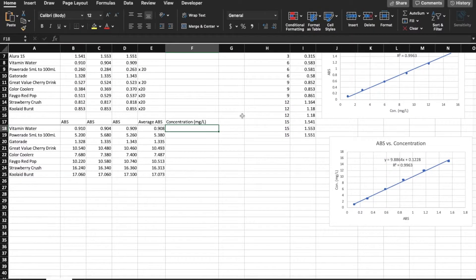So I'm going to use this equation that I got from the graph to find the concentrations of all the commercial products. So if I plug that in Excel's formula, just use the average absorption right beside it. And then what I'm going to do is just drag that formula on down and just get all the concentrations. And there you have it, that's it.